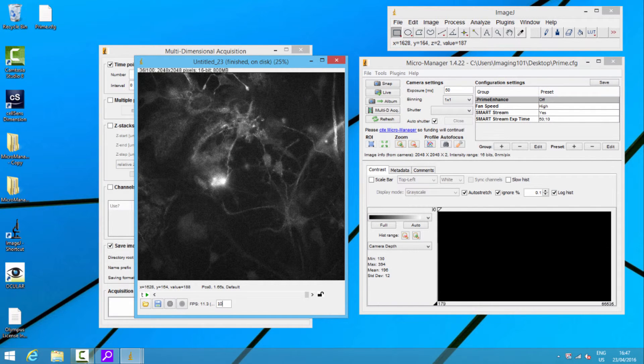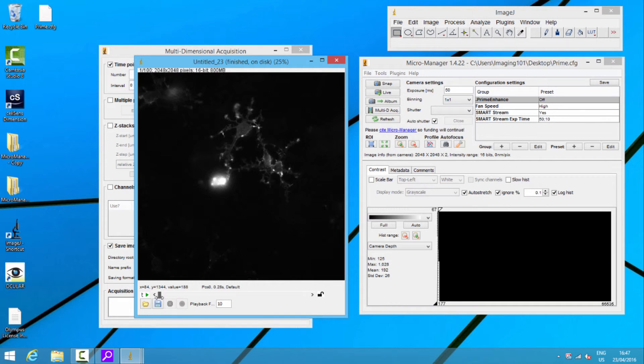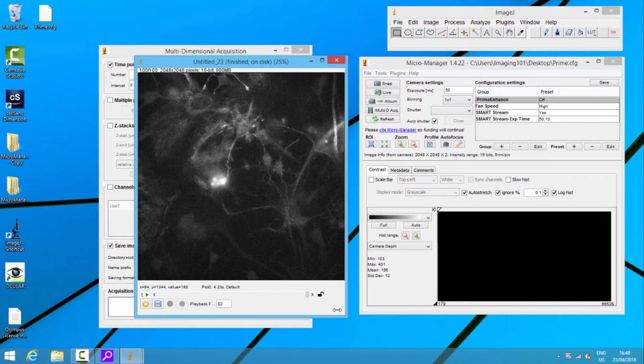If I was using USB, I'd have to stop and upload a different parameter for the exposure time. But now running smart streaming, I'm getting about 100 frames in four seconds — running at 25 frames a second. So with multi-trigger out you can get images as fast as possible, and with smart streaming you can use different exposure times with that fastest possible triggering. Really rather neat.